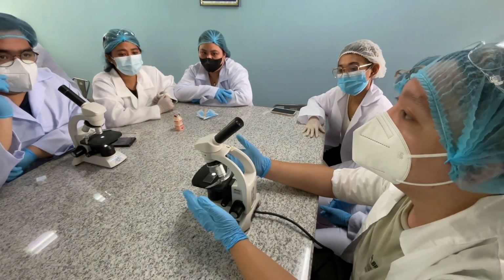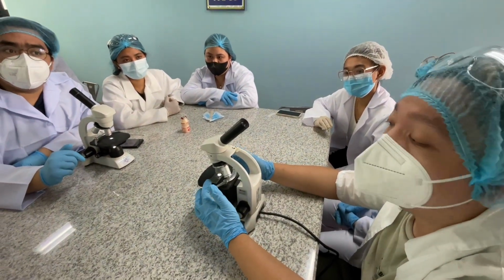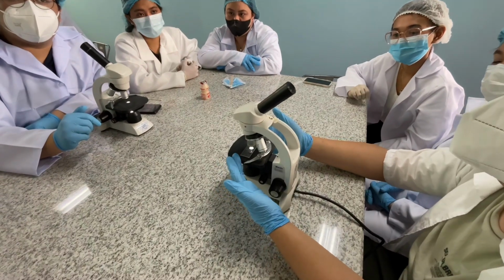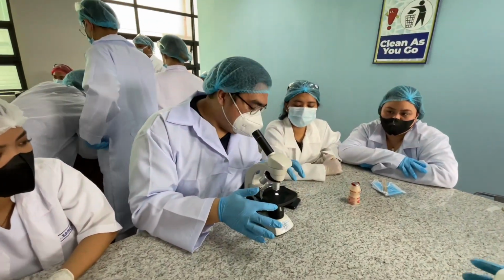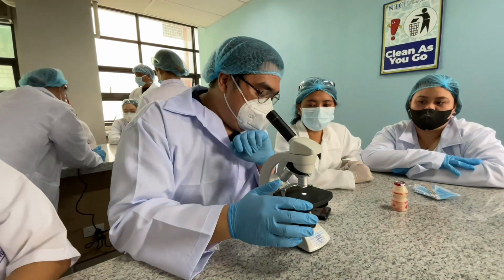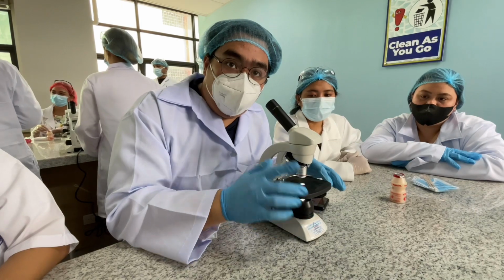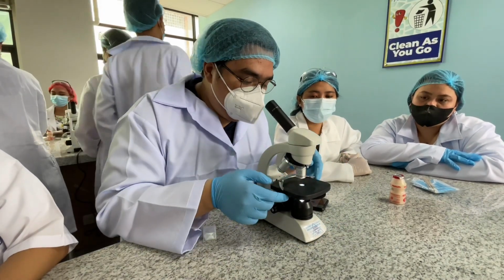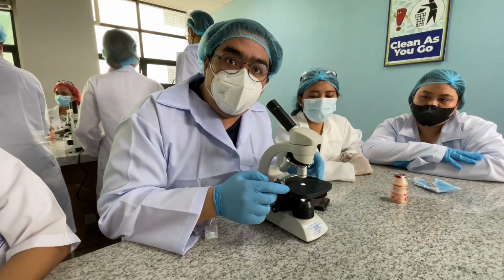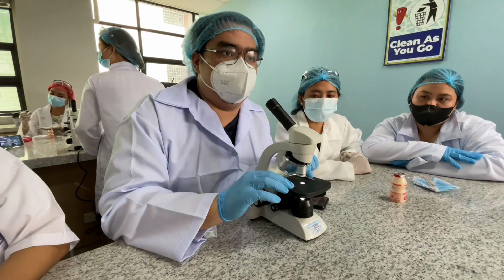And of course, makikita natin our specimen, the slides and the cover slips. We have here, what do you call this one? Now, this part is called the stage, and it has two components. One, the stage itself where you're gonna place your specimen. Two, the stage clips. They are the ones who will secure the specimen in place while you are observing them.